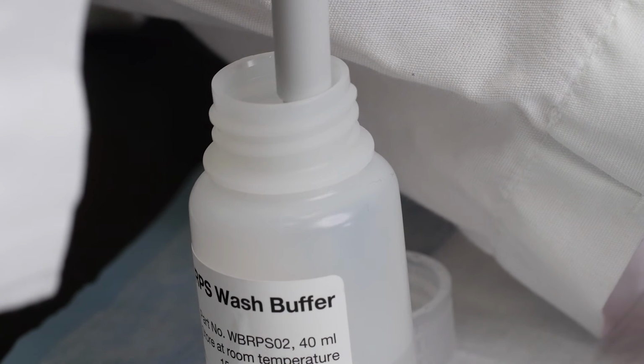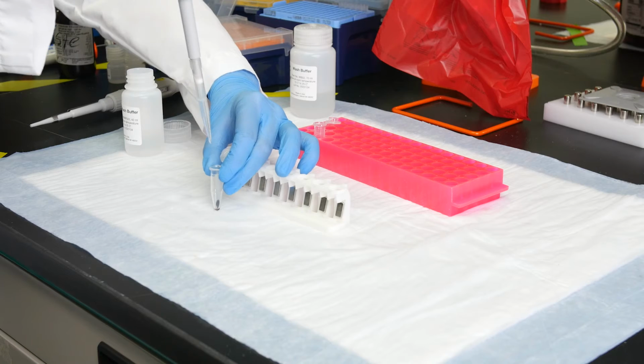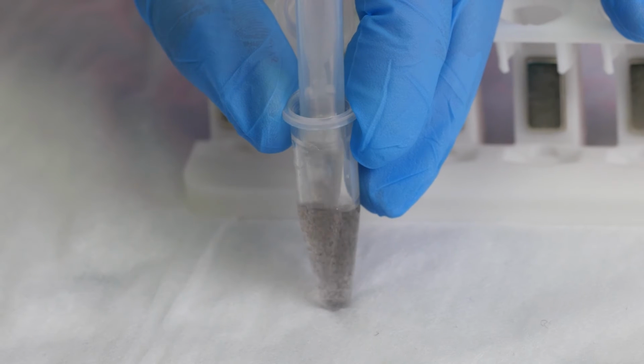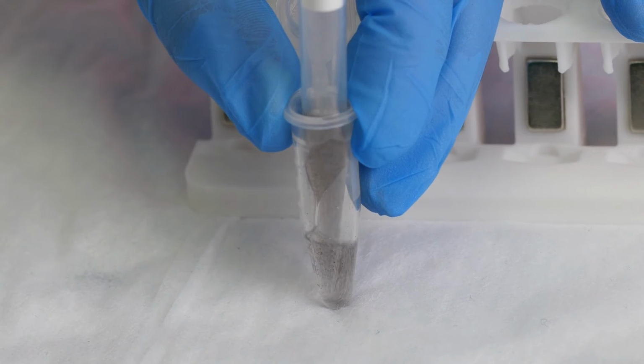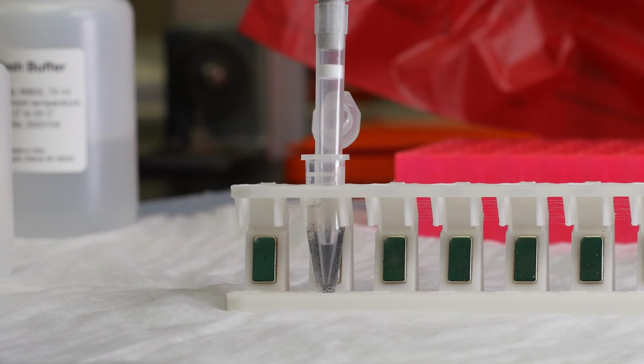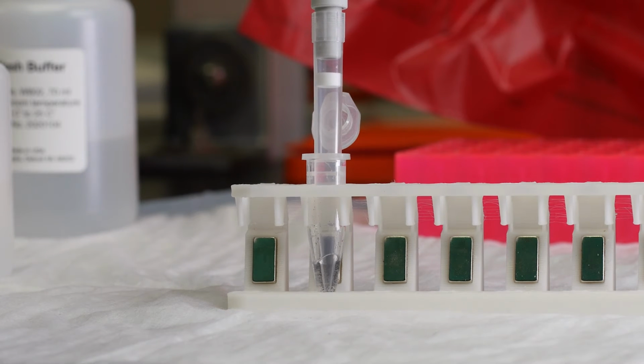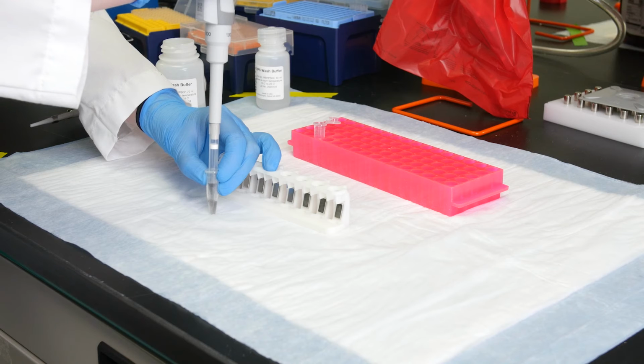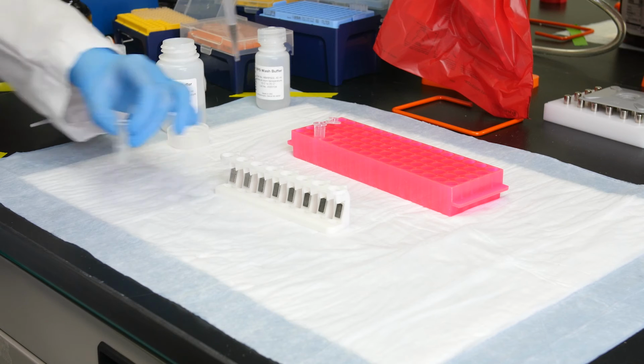Add the RPS Wash Buffer as indicated in the protocol. RPS Wash Buffer has chelating agents that remove the calcium chloride ions. You'll perform this wash step 2 more times, but this time with regular wash buffer that doesn't have chelating agents. Between the second and third wash steps, you can transfer to a fresh vial to help minimize contamination, but this is not required.